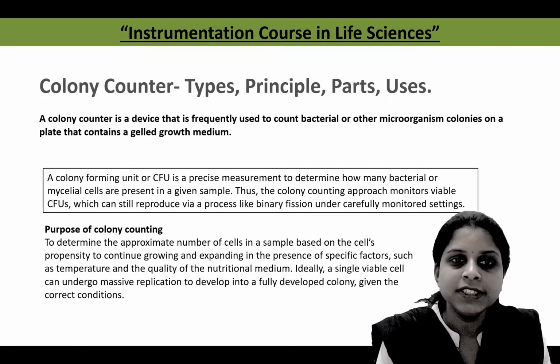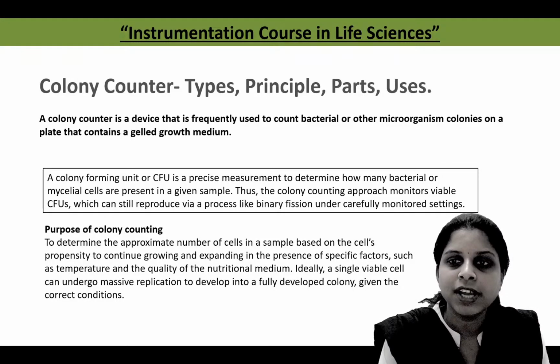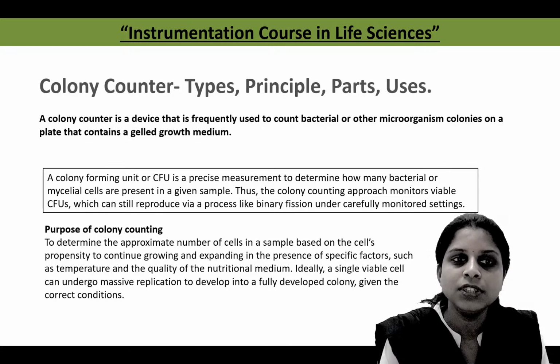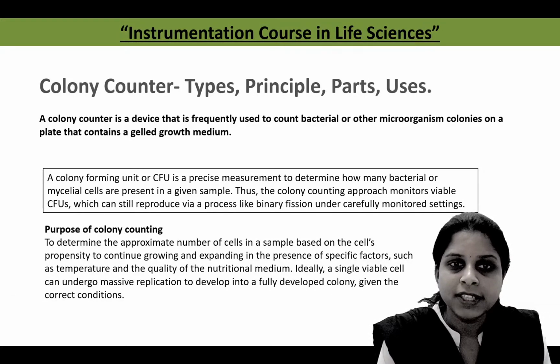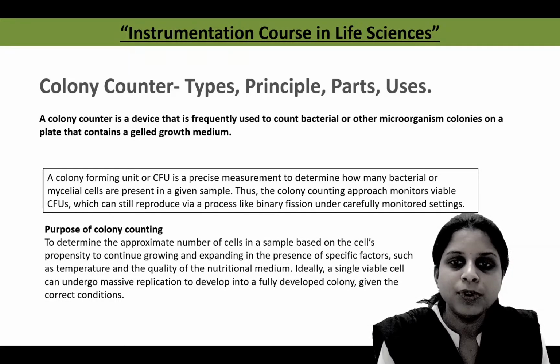A colony counter, as its name suggests, is an instrument or device that is frequently used to count bacterial or other microorganism colonies which have developed on a plate that contains a gelled growth medium. One microorganism cannot give rise to a colony after completion of one cell cycle; one colony is produced by multiple cell divisions of one microorganism, or one colony is the population coming from repetitive cell division of one bacterial cell.